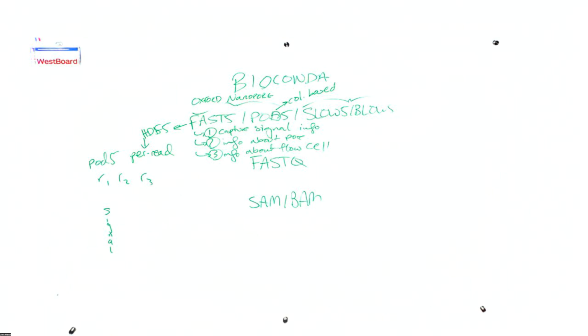And then the last format, the community-based format, why it exists, is that parsing data through these POD5 files or through the FAST5 files, it's pretty unintuitive for most bioinformaticians. And it's not aligned with, as I mentioned, the row-based systems that FASTQ and SAM implement. So since that's how people are used to it, SLOW5 was basically developed along with a toolkit called SLOW5 tools that you'll use today in order to take this data and organize it more intuitively.